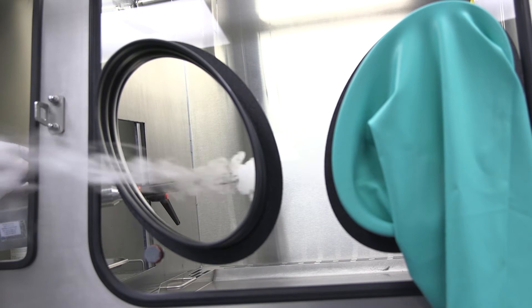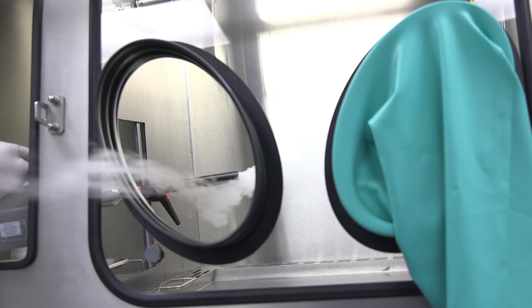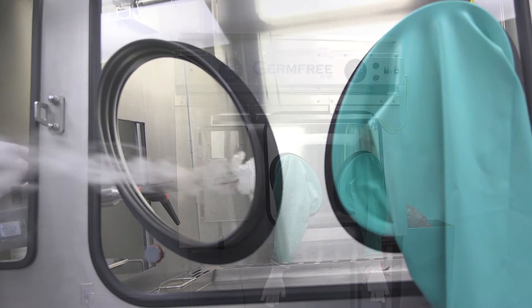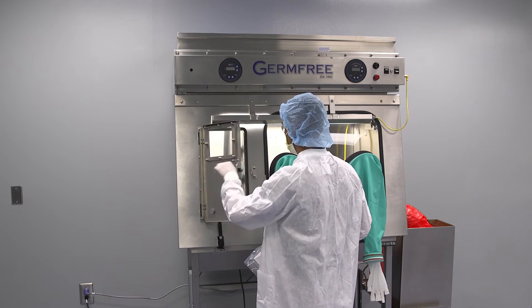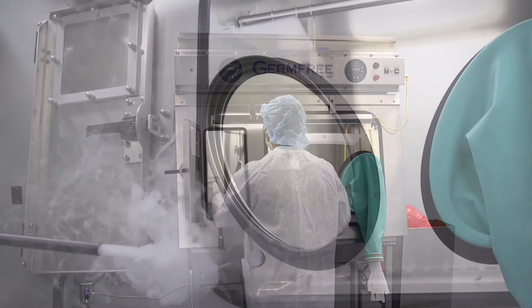If a breach of containment, such as a tear in the glove, were to occur when there is positive pressure inside the Versaflow, the air inside the unit would flow outward. The outward flow of HEPA filtered air would provide protection for the product inside the Versaflow by keeping contaminated air in the room from coming into the work area.